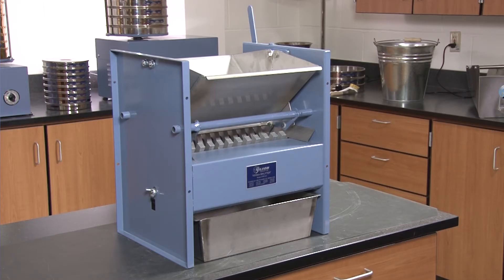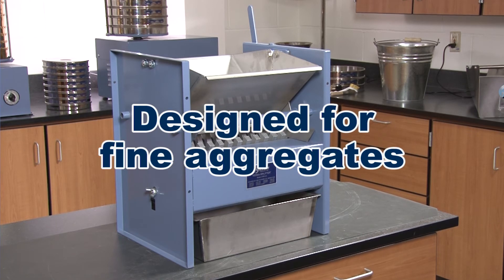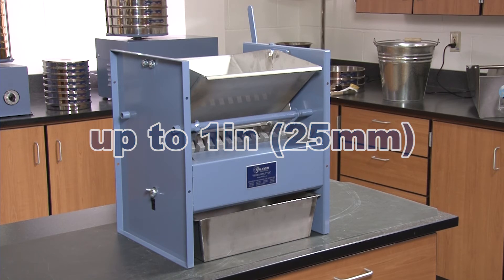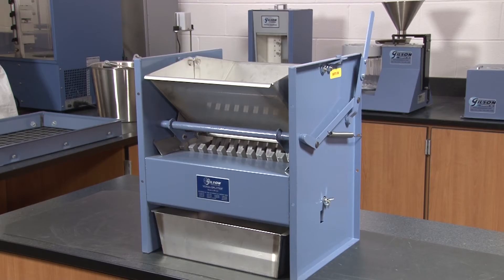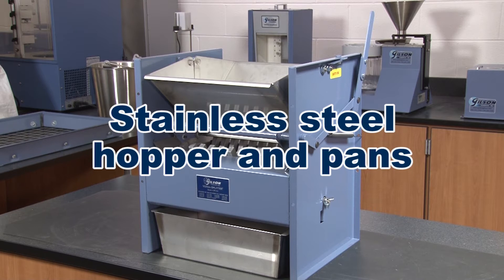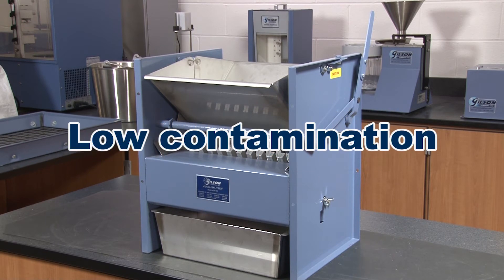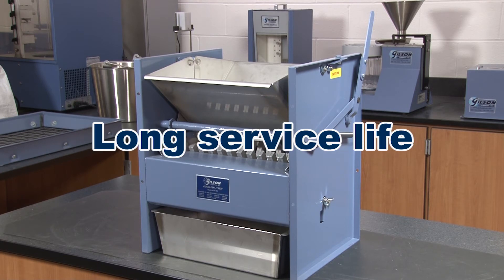The versatile SB 2.5 Universal Splitter is designed for fine aggregates as well as many coarser sized materials up to 1 inch. With most contact parts composed of stainless steel, the SB 2.5 ensures low contamination, low maintenance, and a long service life.